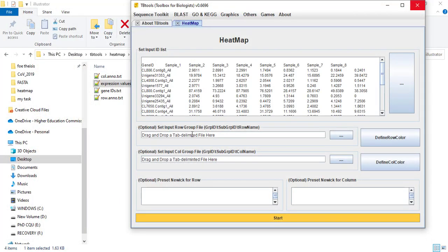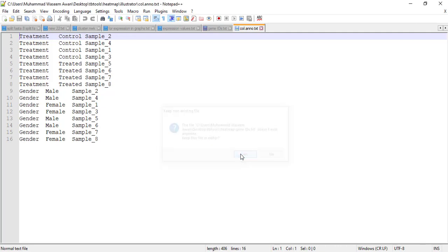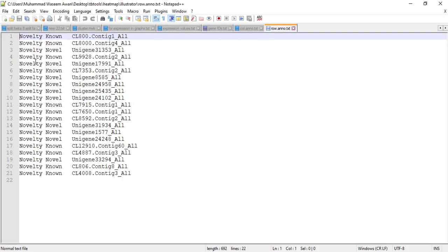Now if you want to group your columns and rows, you need to make a file. For column grouping you need three columns: the first shows your treatment, the second shows whether it is control or treated, and the third is your sample name. For row grouping you also need three columns: the first is the gene ID, the second is the group name, and the third specifies which genes you want to place in which group.